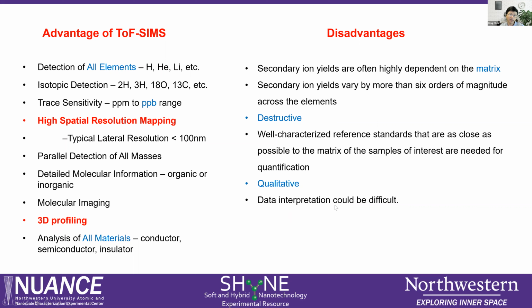Okay, the data interpretation could be difficult. And because this is very sensitive, they have so many possibilities of combination. So you will get a huge data amount. So mostly you should need to focus on what is your element you have, and you focus there. You are almost impossible to label all the elements. You don't have to do that, but you have to label the major peak. You can do that. This is difficult. Maybe it's time consuming, but that is, of course, and we use based our and the software we can label and check the major peak for that.